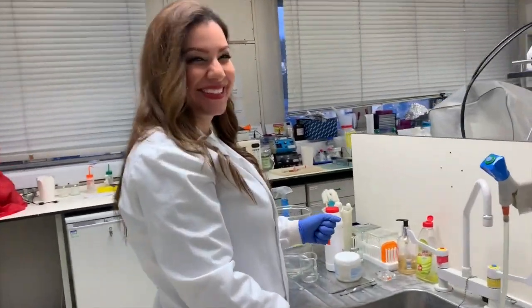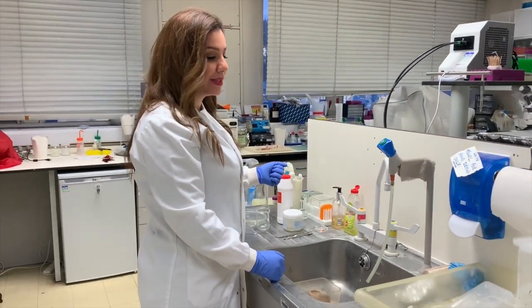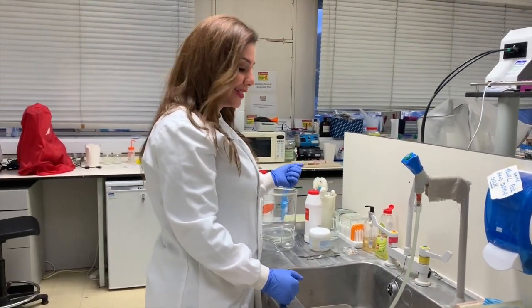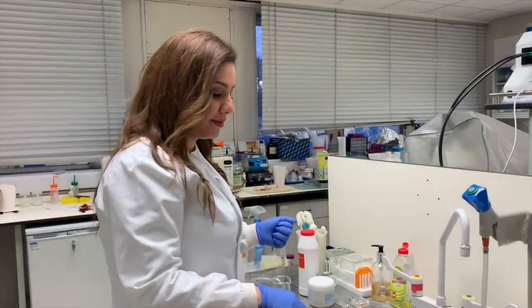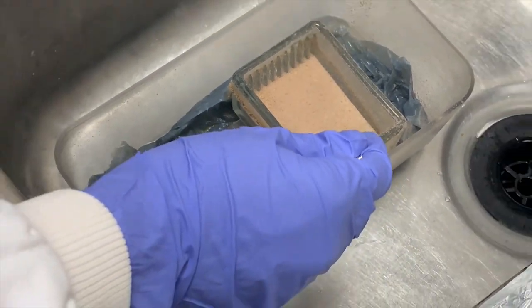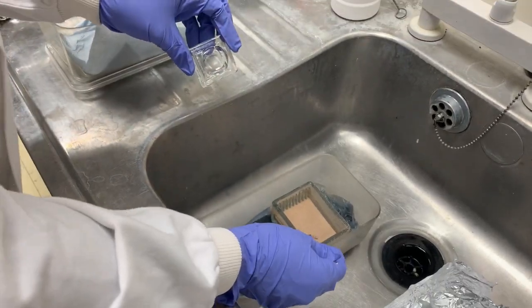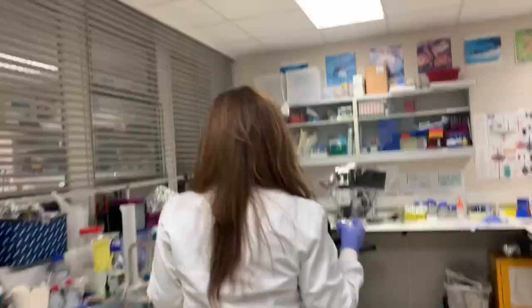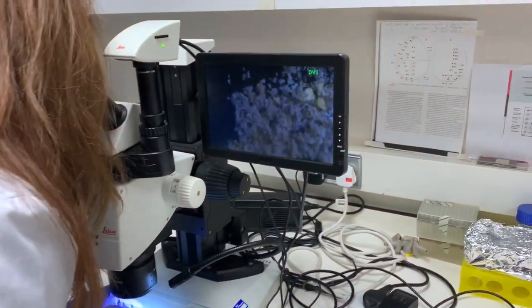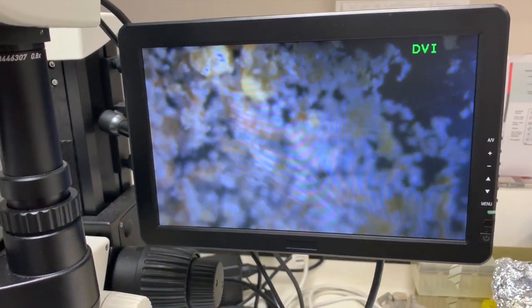Hi Lina! What are you doing today in the lab? I'm trying to start a new colony of mites. We have another growing colony at the moment, so I'm going to make it a new colony. If you come closer and have a look at the colony, I can show you how they look like in there with the microscope. If I take a little bit from here, just a little bit... Wow, that is amazing.